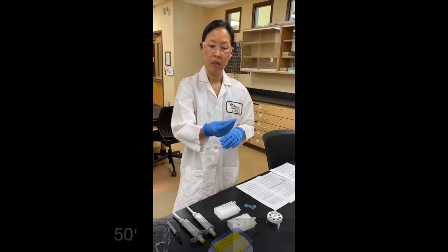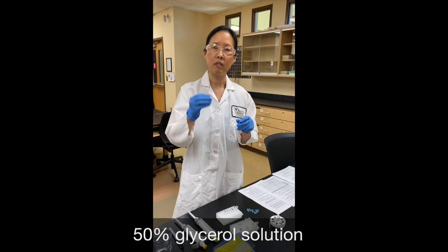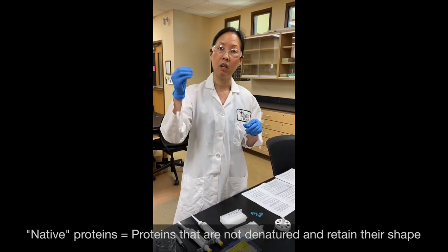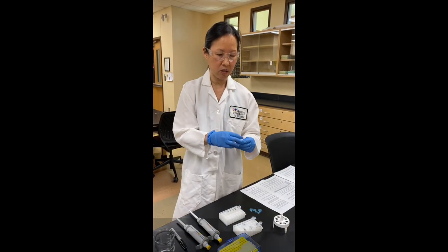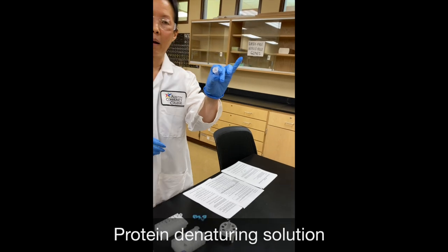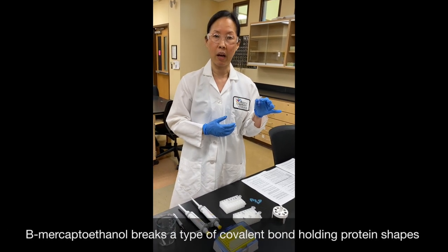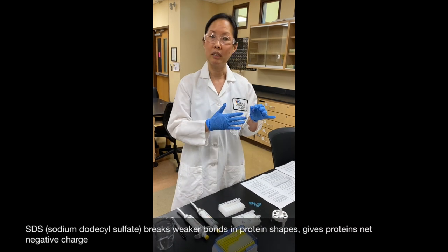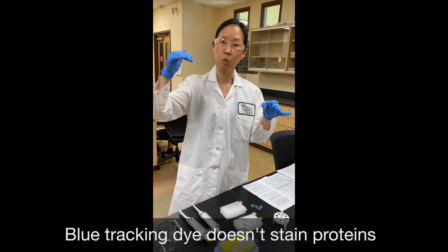The next ingredient is a solution of 50% glycerol. You'll add this to any samples you want to keep native — meaning you're not going to denature the proteins. The glycerol will weigh native samples down in the gel when loaded so they don't float out into the surrounding buffer. Last but not least, there is a blue-colored liquid called Protein Denaturing Solution, which smells like rotten eggs because it contains beta-mercaptoethanol — a denaturing agent that breaks disulfide or covalent bonds holding protein shapes together. It also contains SDS, and the blue color comes from a tracking dye.